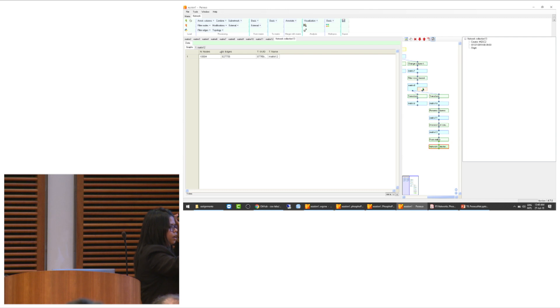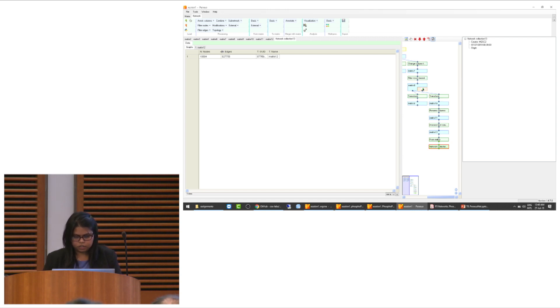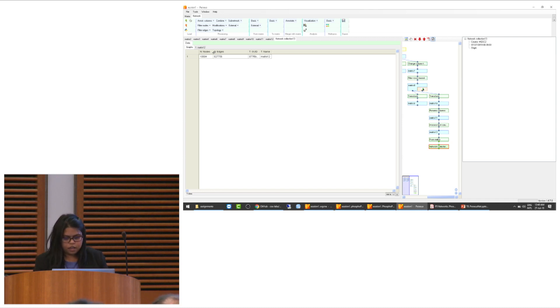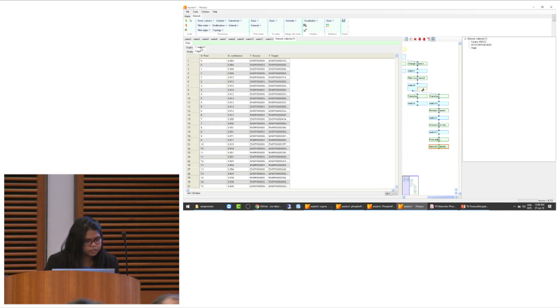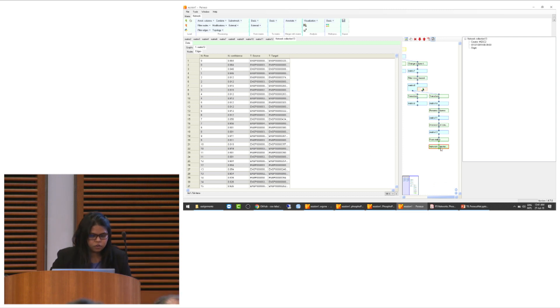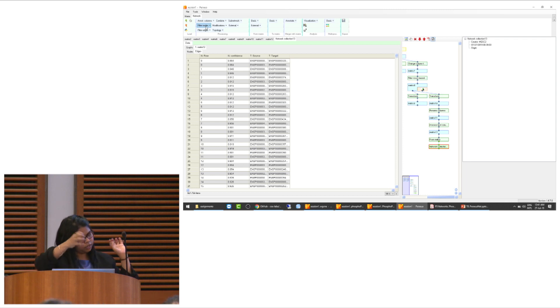Go to Network, then Basic, then 'From Matrix'. My source column is Protein 1 and my target column is Protein 2, so Protein 1 is the source and Protein 2 contains all the proteins it interacts with. Click OK. Now a network collection is generated, shown in light green. When you click it, there is a matrix with two tables — nodes and edges. Nodes are the proteins, and edges are the connections between them.